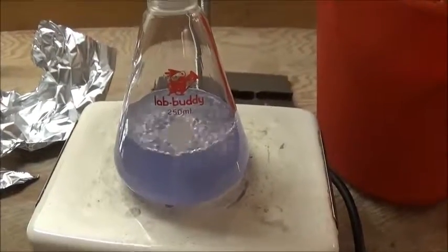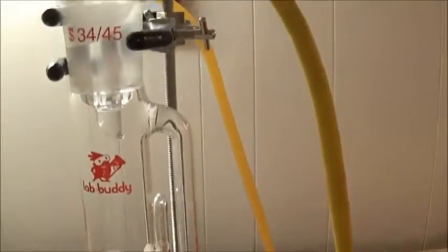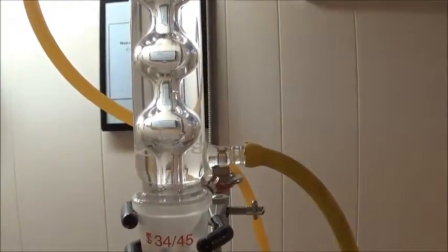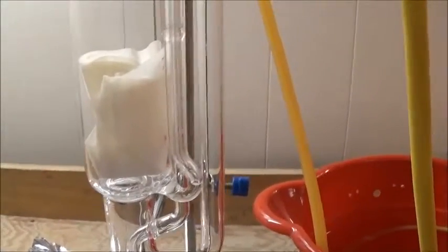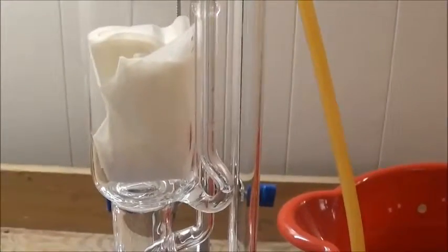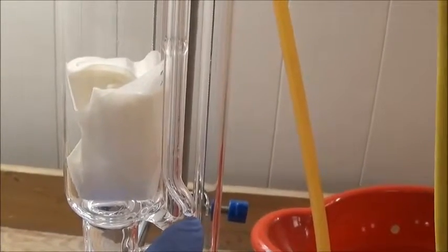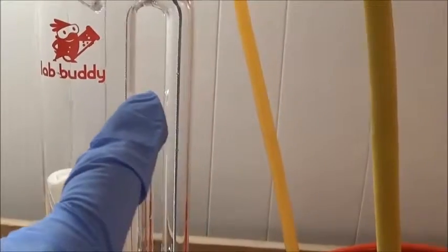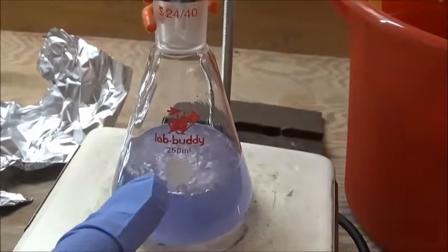As the ethanol in the flask boils, it travels up, goes through the sidearm, and reaches the condenser, where it condenses back into a liquid and drips into the extraction chamber. As the level of fluid in the chamber rises, so will the level of fluid in the tube. When the level gets to the top of the tube, it will go over and siphon out all of the fluid and bring it back into the flask.